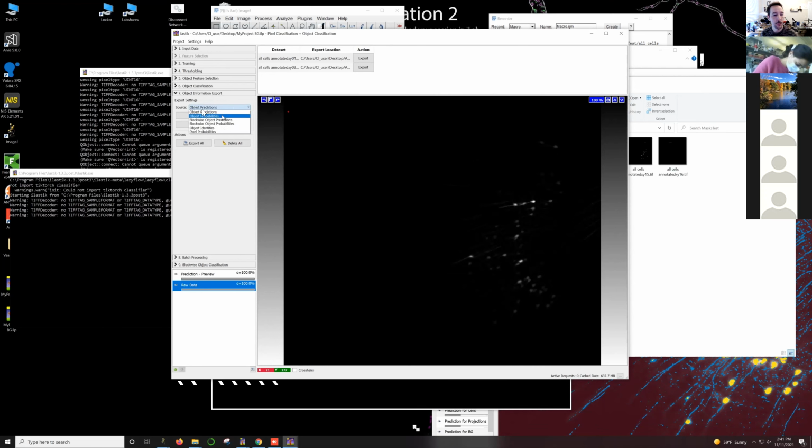What I wanted to show you in here is that if we just do the predictions, we're just going to get an image that's just the cells. But what can be more important is maybe having object identities. This is kind of what we did in the previous workshop in ImageJ. Every single cell will have a different intensity, and that can be useful in terms of just differentiating the cells rather than having just a mask where every cell has the same intensity.